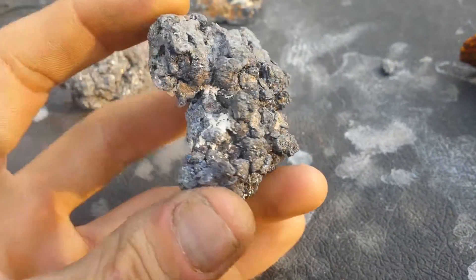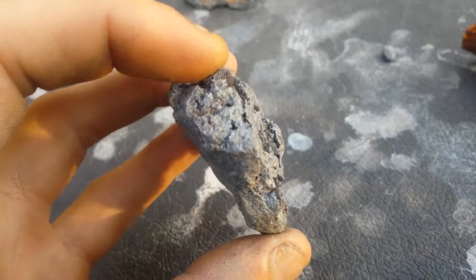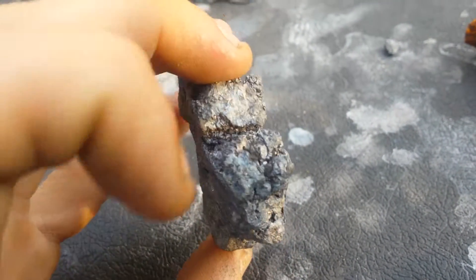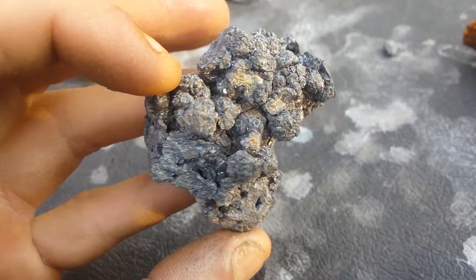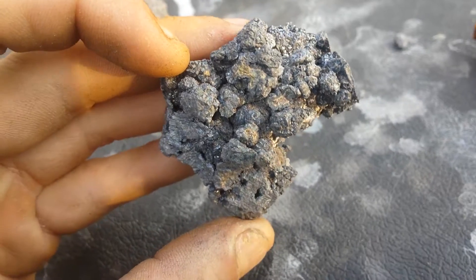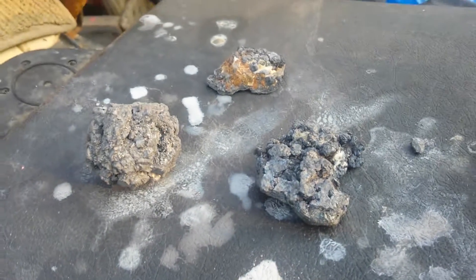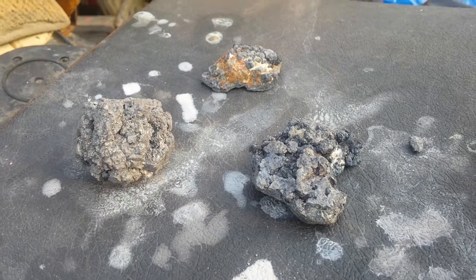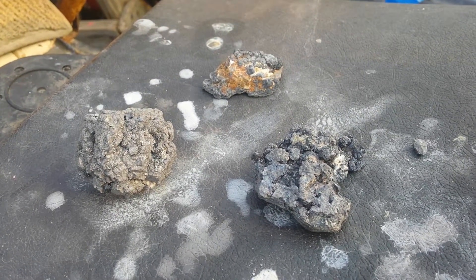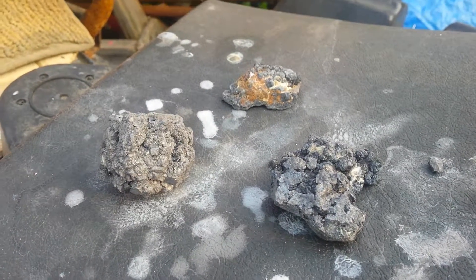I'm going to try to find some nitric acid and do a couple more tests. It's really easy to separate silver from any other minerals as long as you have nitric acid, but it seems almost impossible to get around here. I know some places will sell it, and you can also get hydroponic growing supplies that use nitric acid, though it's only 15% — I'm not sure what concentration I'd need. Anyway, that's a quick look at how a couple of the rocks turned out after the hydrochloric acid treatment.